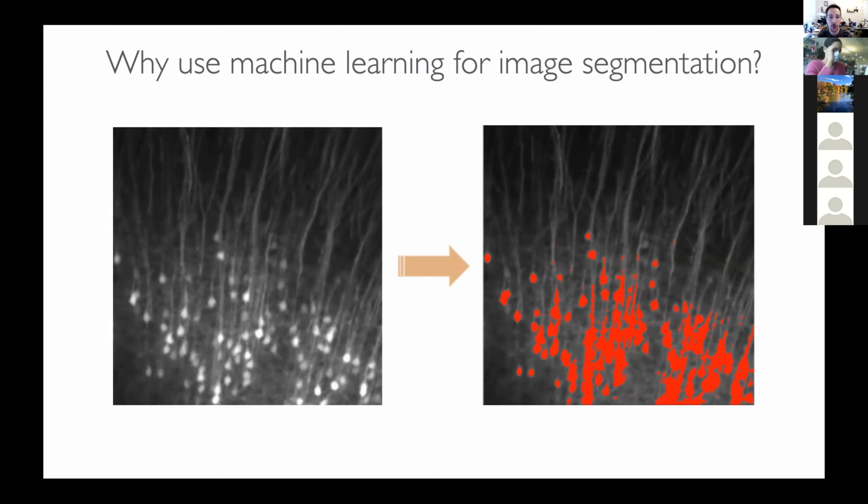But that would normally require a lot of work. We have to think about what filters to use, exactly what process to follow to get a decent result. And often what happens is you'll do that and then go to another brain or another section and find that combination of filters isn't giving you the results that you really need, and there's over or under segmentation.